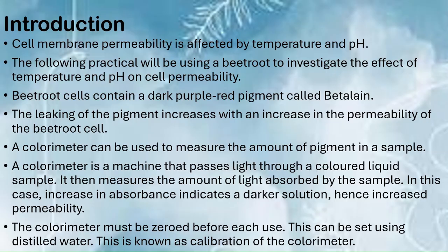So the colorimeter must be zeroed before each use. This can be set using distilled water. And this is how you calibrate the colorimeter to ensure that all your results are as accurate as they can be.